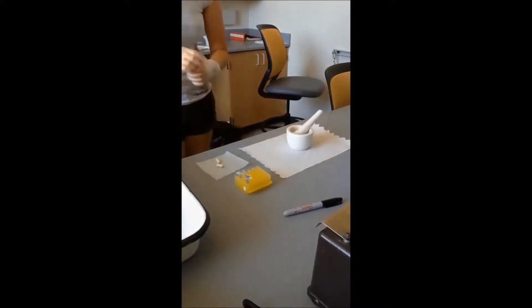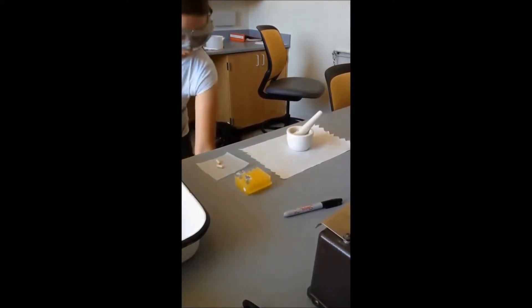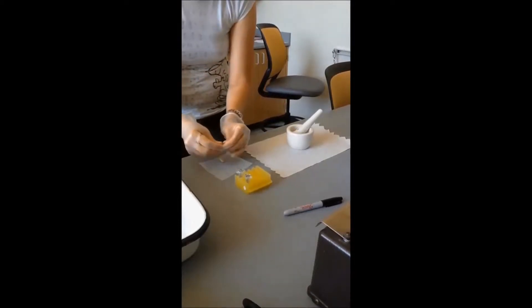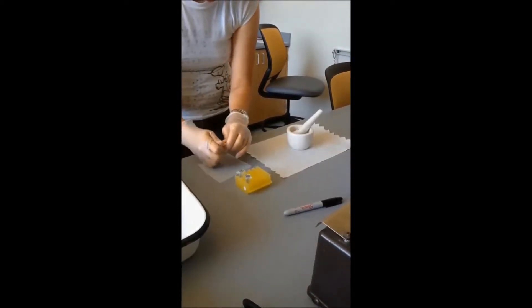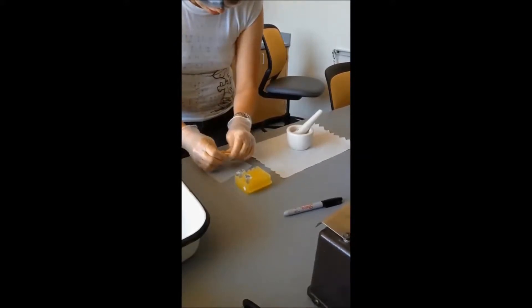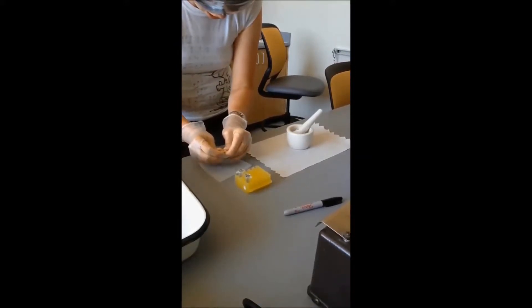So we'll begin while the mortar and pestle is cooling with opening the capsules. They just kind of twist open. Some of them are a little easier than others. Just twist and pull them apart gently.